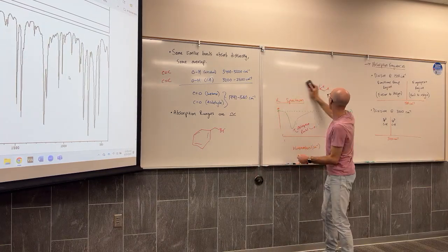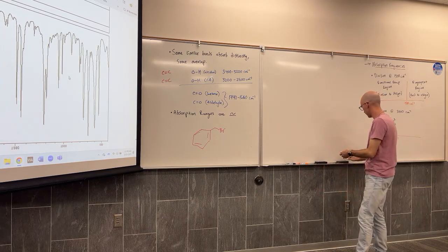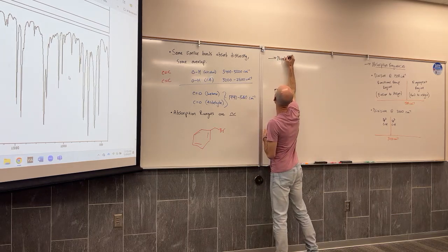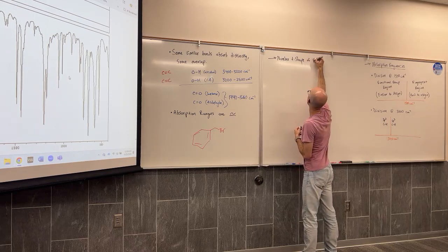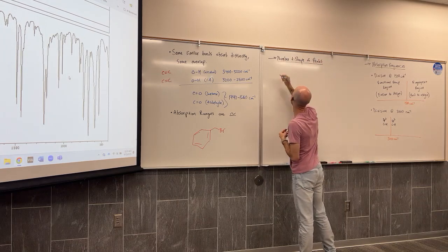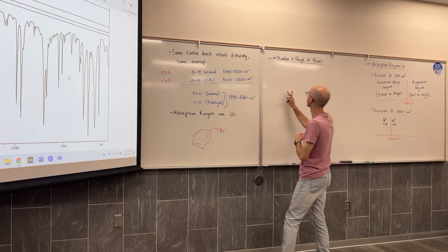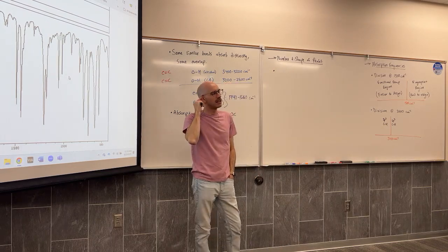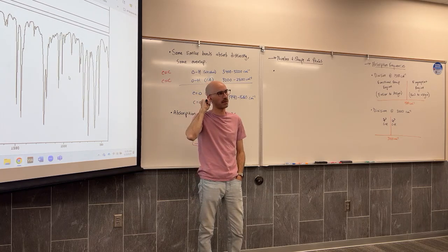So the next thing, moving away from absorption frequencies, the next thing that I want to look at with you guys is the number and shape of peaks. There's a lot of different cases, so it can be hard to summarize it. I'm going to do my best to.